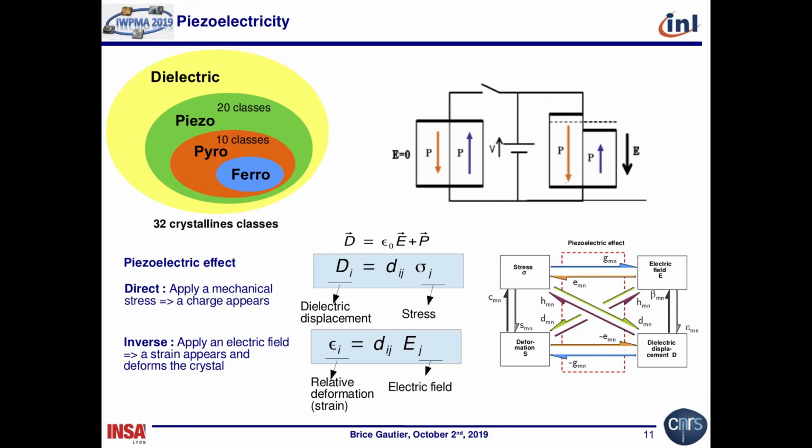Piezoresponse force microscopy aims at measuring ferroelectric polarization. That means the remnant polarization, the coercive fields, and also the direction of the polarization. But it's not possible using an AFM directly to measure this electrical parameter, which is the remnant polarization. So you have to rely on the mechanics.